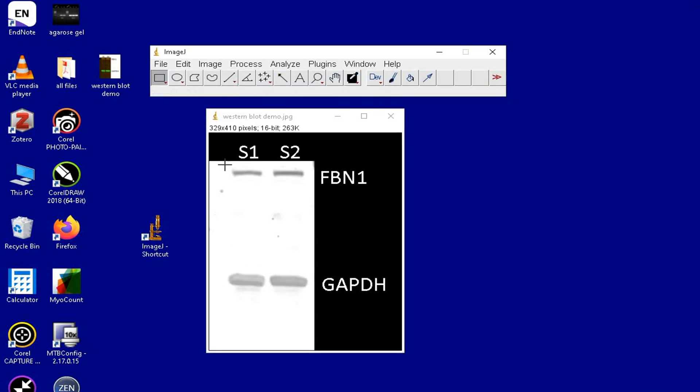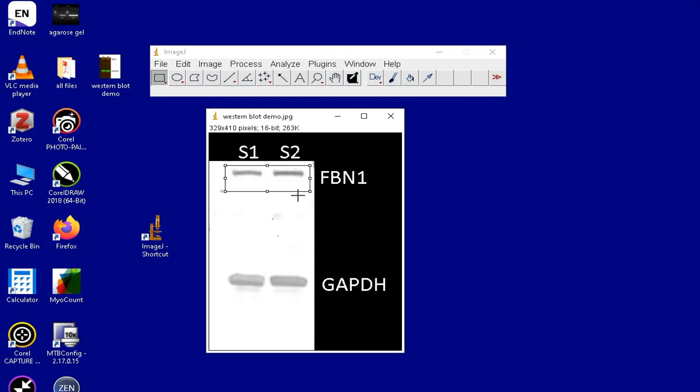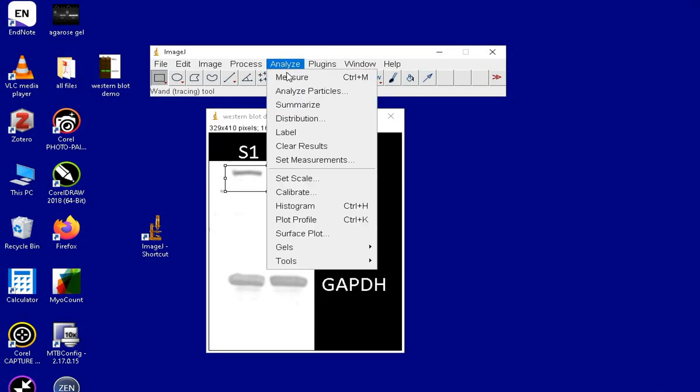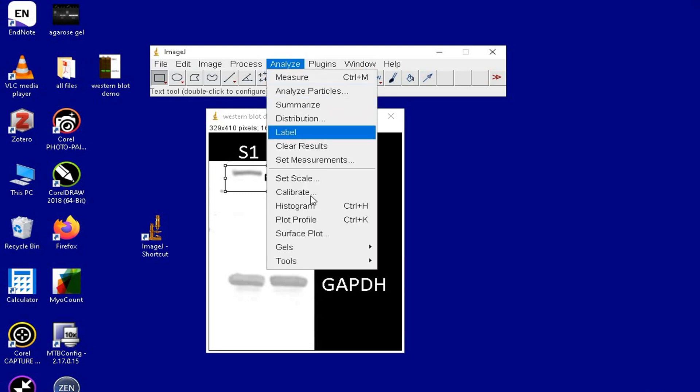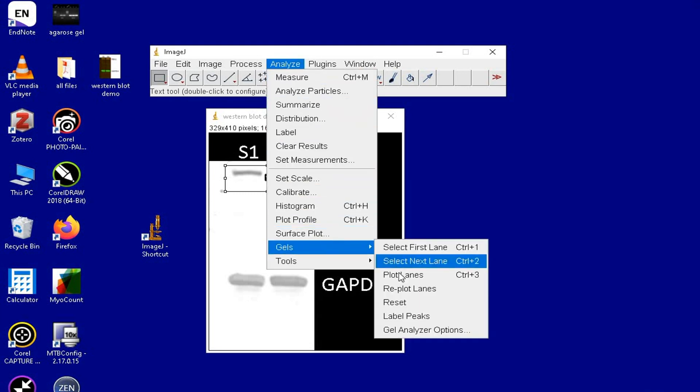Select the rectangle tool again and then draw a rectangle that completely boxes the bands in the blot. Click on Analyze, Gel and select First Lane. Now, the rectangle box is marked as 1. Again, click on Analyze, Gel and Plot Lanes.